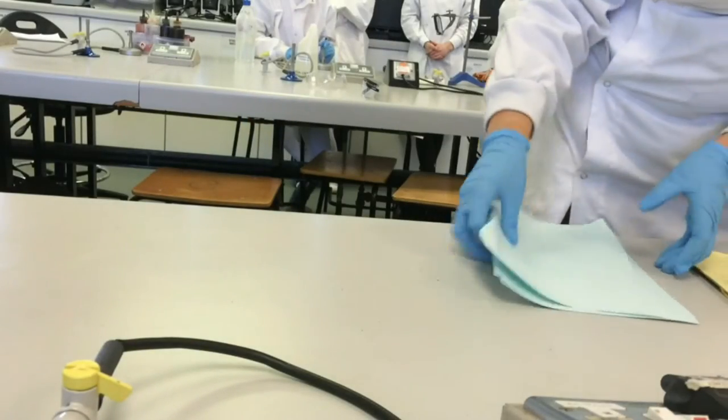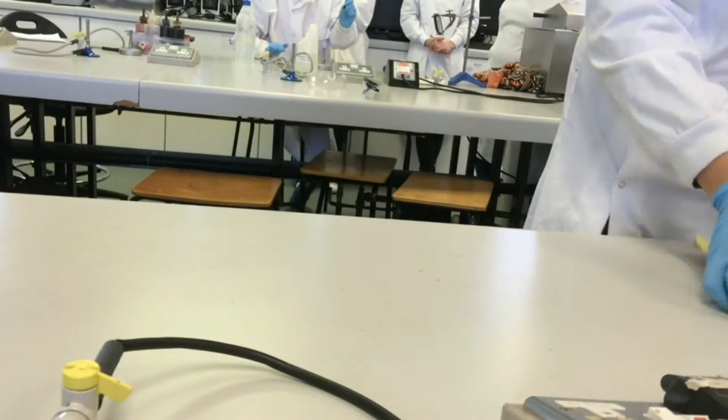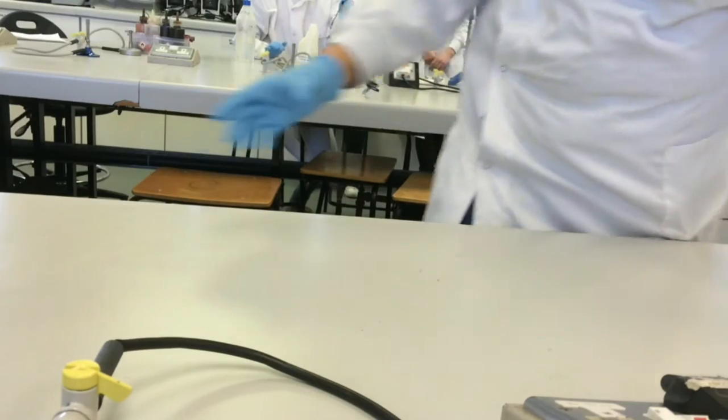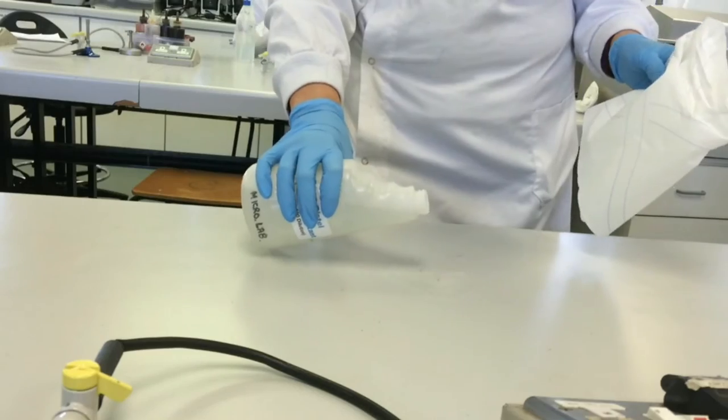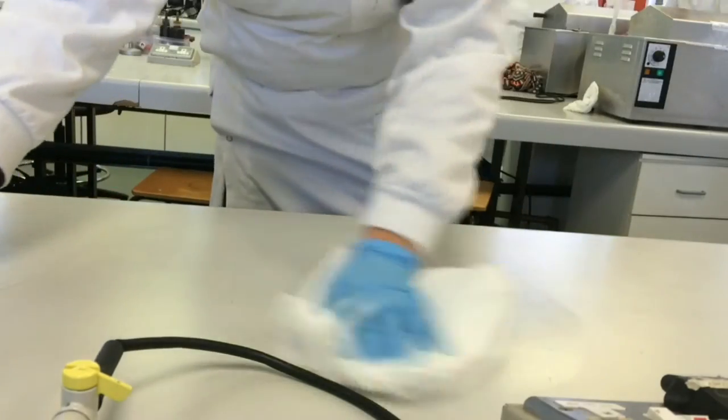Keep the workplace tidy at all times. Use a disinfectant on the desk before and after practical.